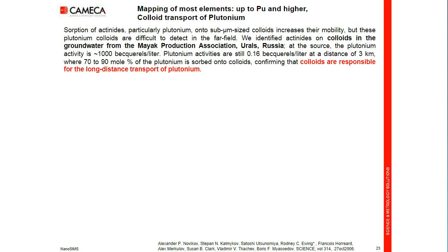In order to illustrate the large range of accessible elements, I took this scientific paper published in Science around plutonium. Here, the researchers focused on analyzing colloids found in groundwater at a few kilometers around a nuclear plant in Russia.